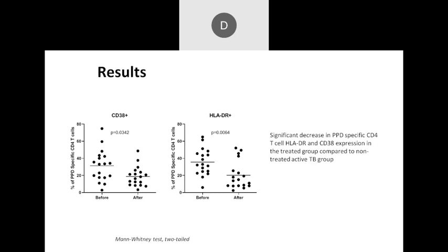Okay. So this flow cytometry for infections is only for research? You think like that? I think it still needs research. We still need to do research. I'm hopeful we could get some sort of clinical test from it. You know, it's like the quantiferon assay in a way.